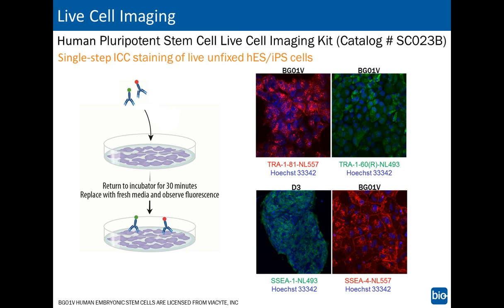But what this really allows you to do is have a quick assessment of pluripotency, the pluripotent makeup of your stem cells, without having to sacrifice a well to do so, and without affecting the ability of the stem cells to continue to expand or to continue to differentiate into downstream experiments.